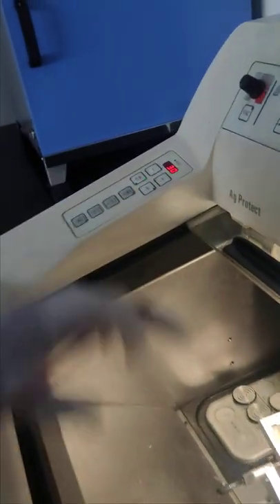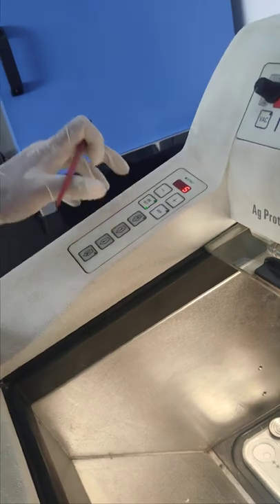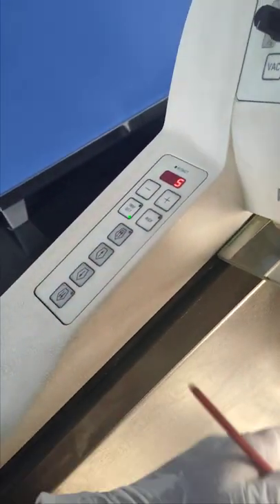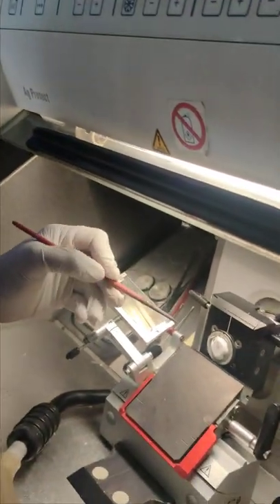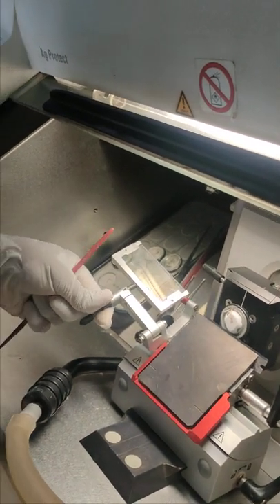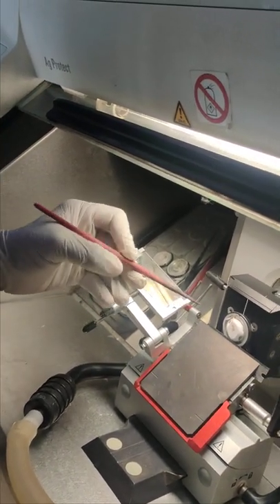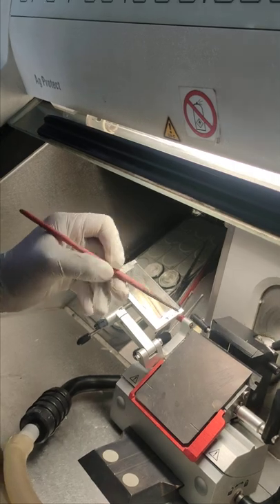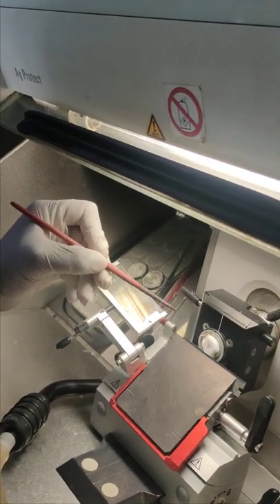Once the tissue is trimmed, we section at 5 microns. We can either apply an anti-roll plate or use a brush to take the section.